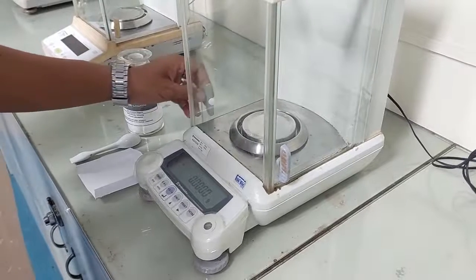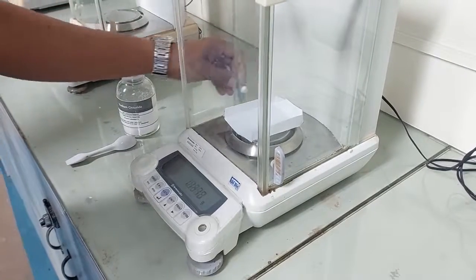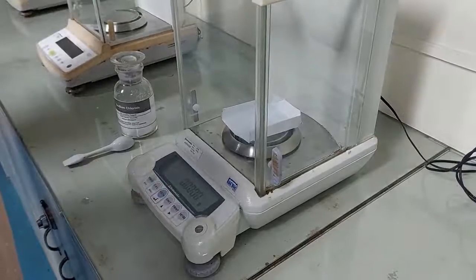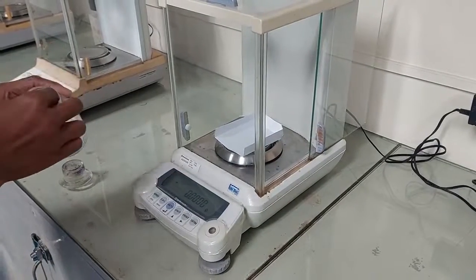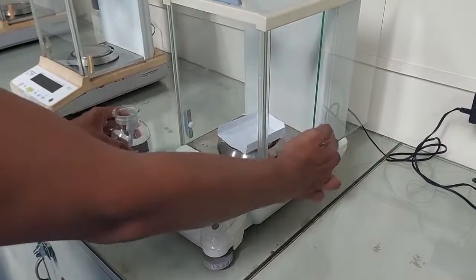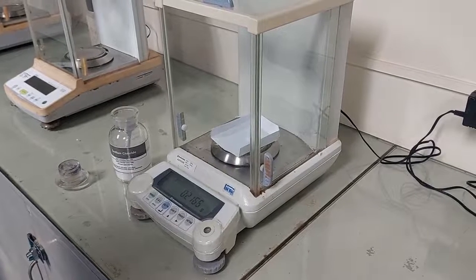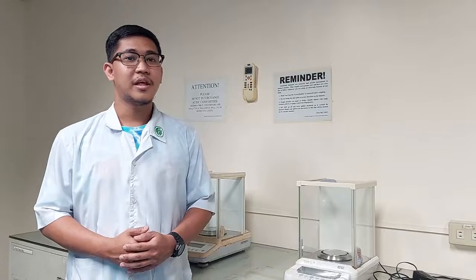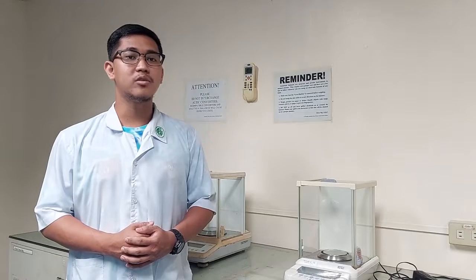A weighing paper is placed on the balance pan and the tare button is pushed. Zero should appear on the display. If a substance is now added to the weighing paper, only the mass of the substance is displayed. Taring is a very convenient method of weighing out chemicals, one you will probably use quite a lot.